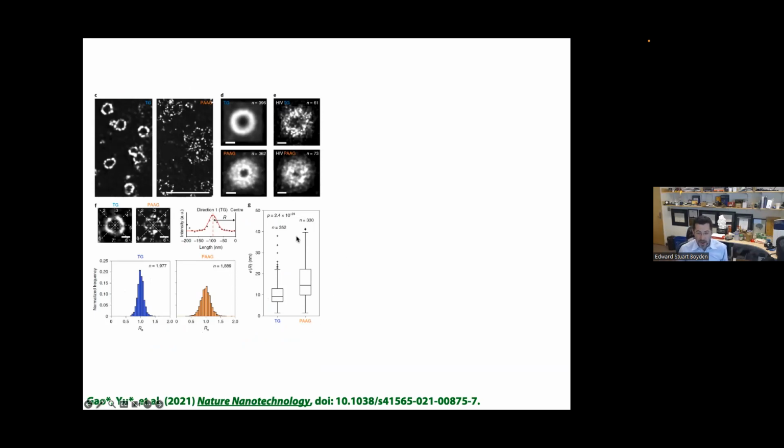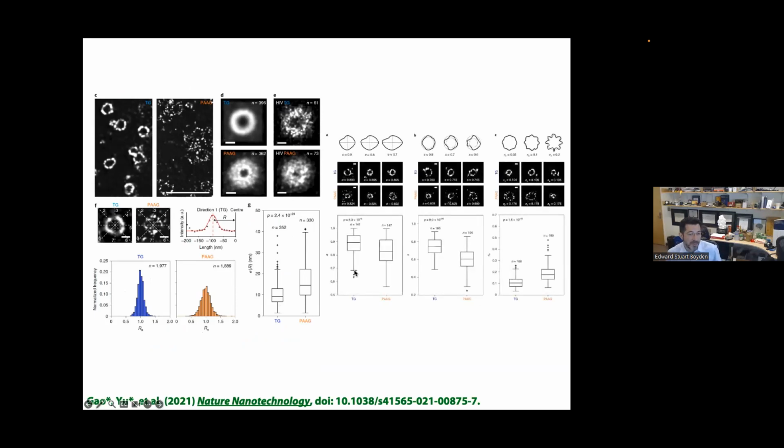The take-home message is in panel G. The classical gel, as I alluded to, would introduce about 15 nanometers of error, but the new tetrahedral gel introduced around 9 nanometers of error. And that was borne out by preserving the shape of the viruses better.